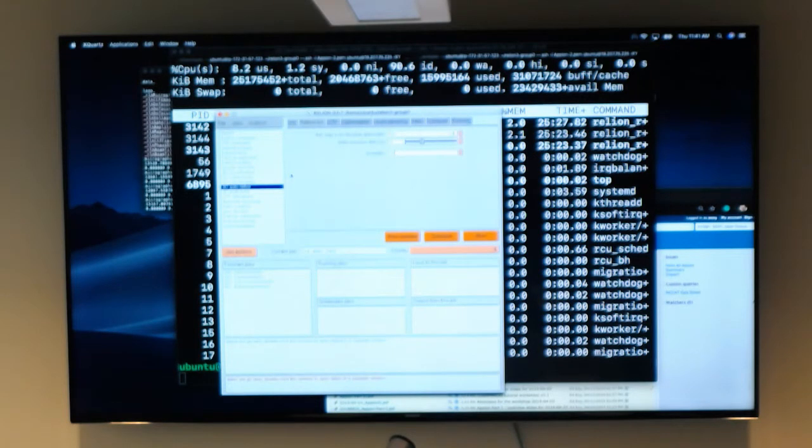Some packages by default already pre-process or auto-fill certain steps so that you never have to worry about accidentally introducing model bias or processing the data in a way that would lend itself to misinterpretation of the data. It's not foolproof, but you want to be aware of massaging your data to get more information versus massaging your data to optimize criteria which is completely decoupled from answering a biological question.